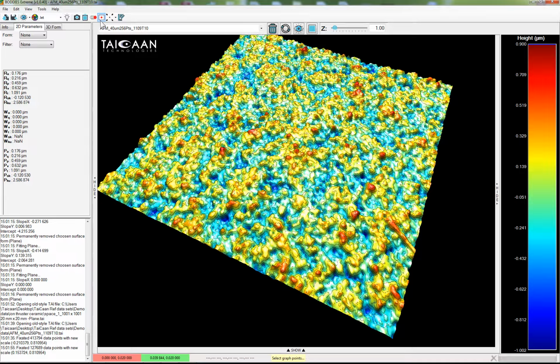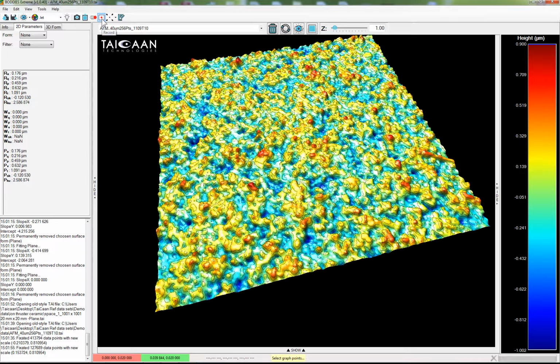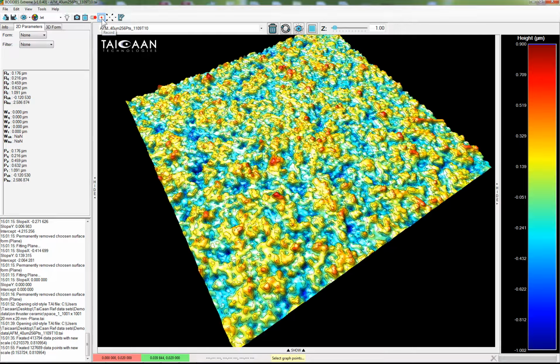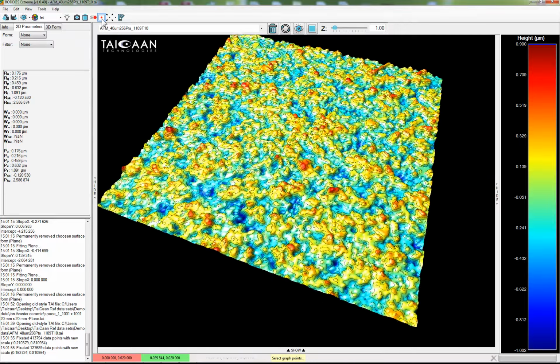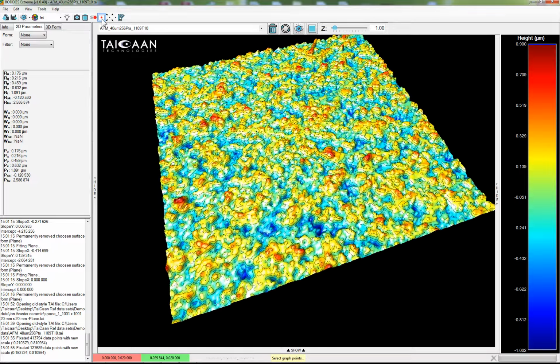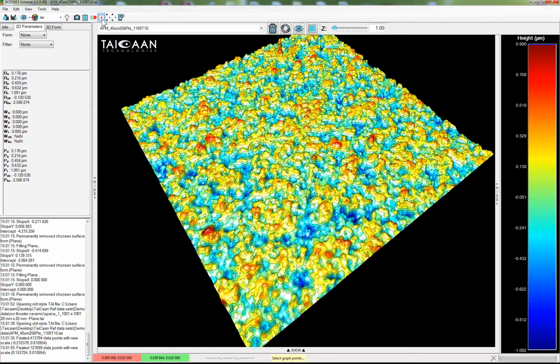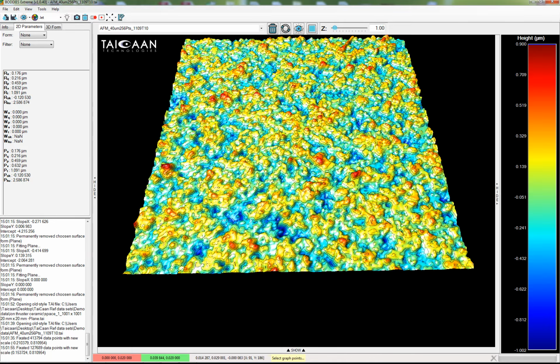To the right of that, the Japanese flag is in fact recording. So it's a record button. If we hit this, we're going to record the animation, and that will allow you to save the animation to a file location so that you can use that for future purposes. Again, a very useful capability. Okay, let's stop the animation and go back to our basic view as shown here.